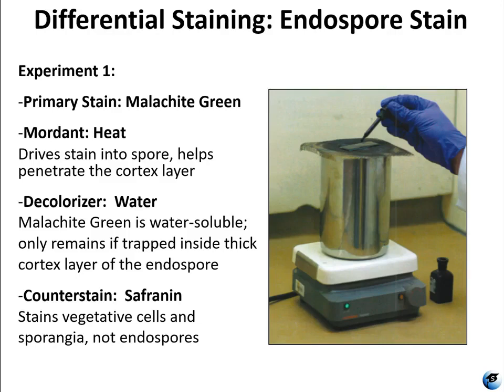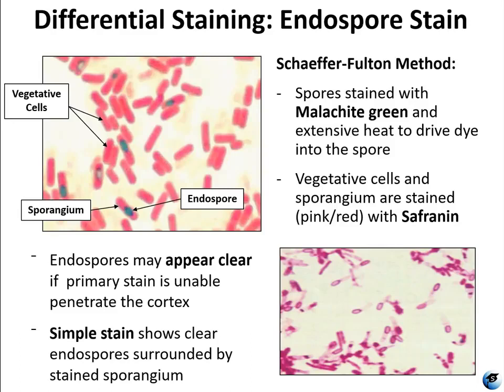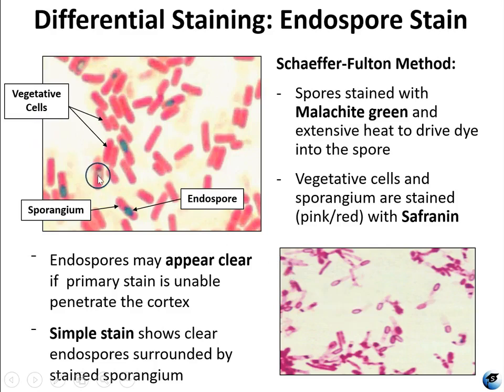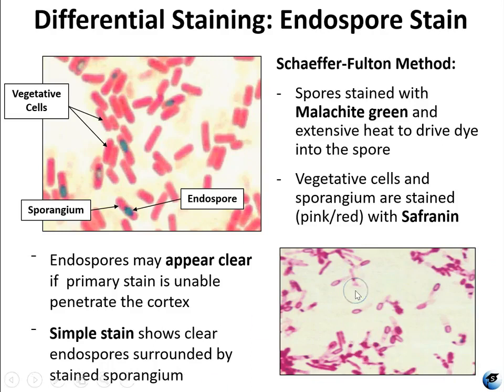Safranin will stain the vegetative cells and the sporangia, but it won't be able to penetrate the endospore. The green endospores appear either within the vegetative cells or separate from the cells altogether. Notice that some endospores appear clear — that just means the malachite green was not able to fully penetrate the cortex layer. Sometimes you can also find endospores with just a simple stain using crystal violet, and they would appear as clear.